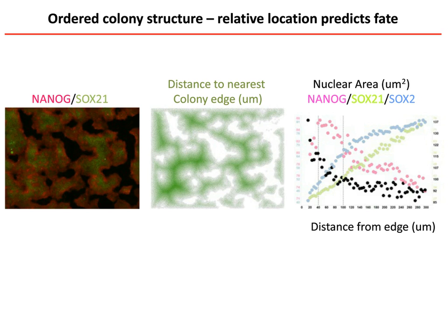Here we're showing a fourth dimension, which is a very simple output from the high content analysis, and that's nuclear area in microns squared. So as nuclear area decreases, the expression of proneural transcription factors increase. And so it's very easy for us to represent all these dimensions in a single plot like this. So a high content assay incorporating these parameters is shown on the next two slides.